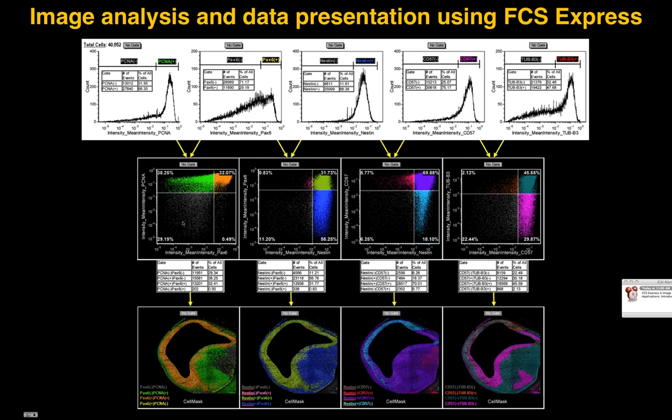With this, we actually have all the quantitative analysis, much like the flow cytometry data, with the total number of events characterized on the double positive, double negative, and single positive cells, as well as percentages of the total cells out of this population.